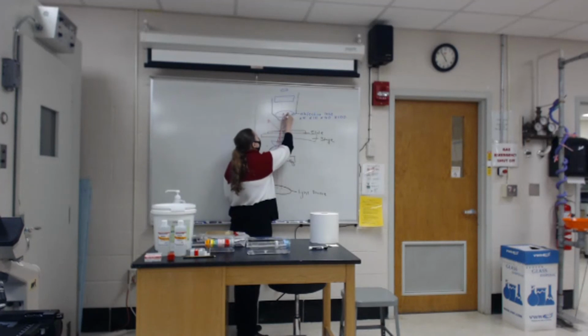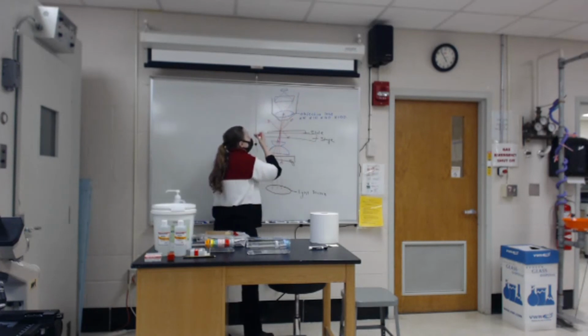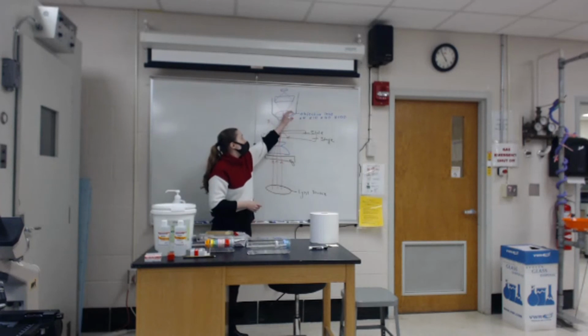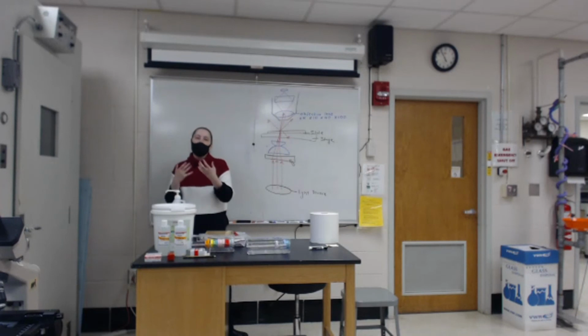When light goes through the objective lens, it will actually bend, and this will increase the magnification. And this middle lens will bring the light into the ocular lens, so that we'll actually be able to see the sample. This objective lens is going to be convex, meaning it's going to go out. And that's what helps aid in the magnification process: the shape of the lens.